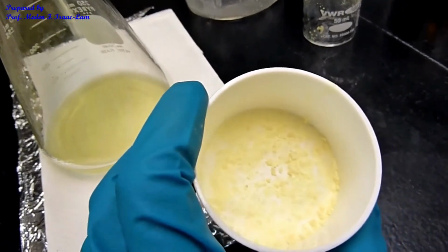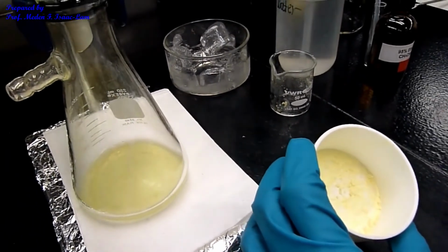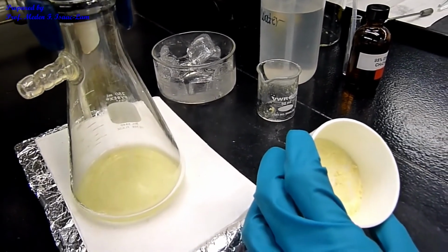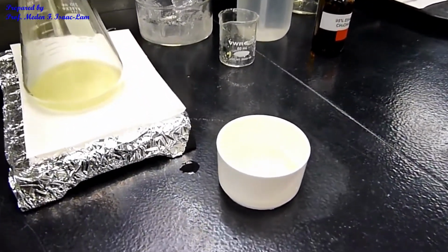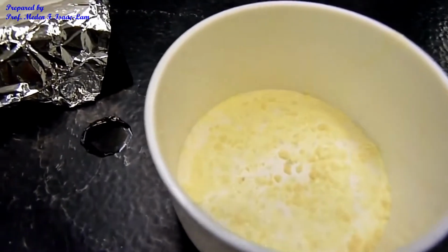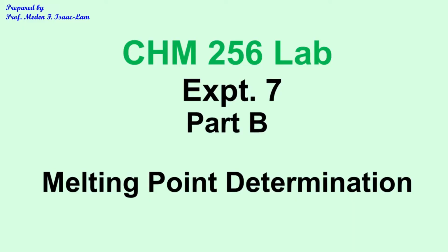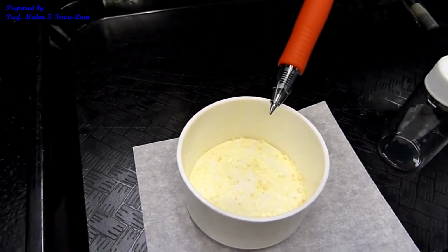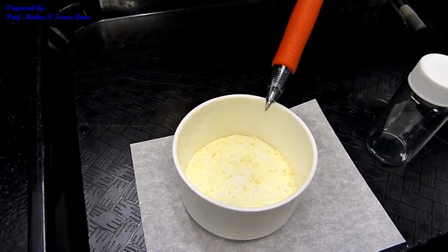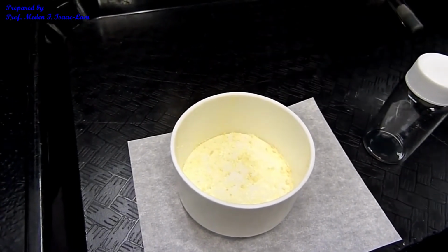Okay, so we are going to dry this till next lab period for another week, and then we are now going to do the melting point determinations. That's our sample. The aldol condensation product, after a week of drying, it's yellowish in color. It's deeply colored yellow. And I'm now going to scrape it from the filter paper and then transfer it into the vial.